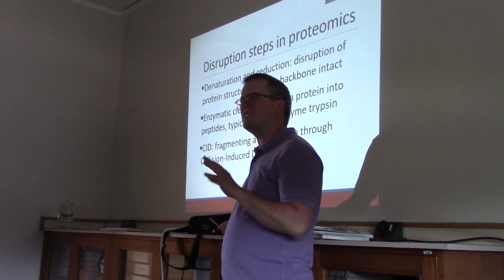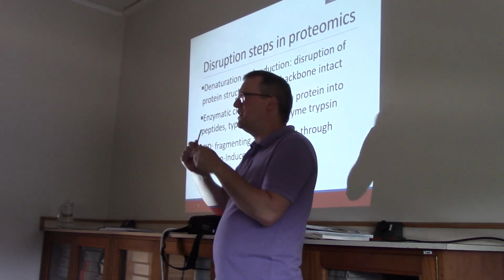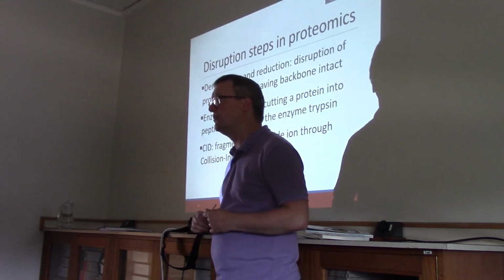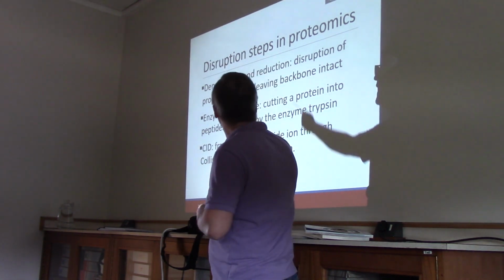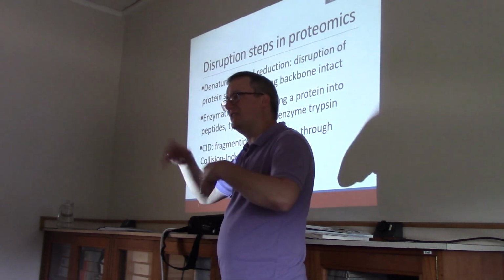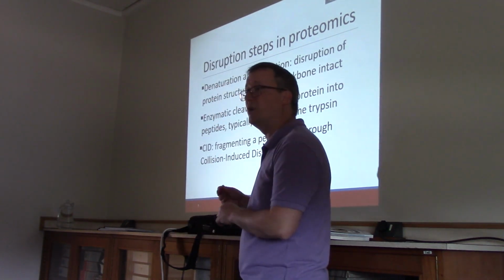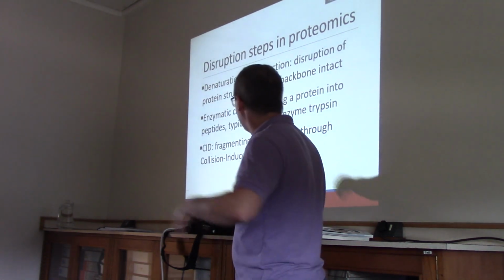First off, proteins have kind of a complex structure, you know? They're all bundled up and they have these disulfide bonds holding them in place, and they have a lot of structure, and most proteins are kind of resistant to proteolysis, chopping them up. So one of the things that we want to do is to denature these proteins, to cause them to stretch out and to reduce disulfide bonds. You know, if you're trying to unfold a blanket and it's all held into a jumble by a bunch of safety pins, you probably want to take those safety pins out before you try to flatten the thing. Proteins are the same way. We want to cut these disulfide bonds as we denature the proteins to make them linearize nicely.